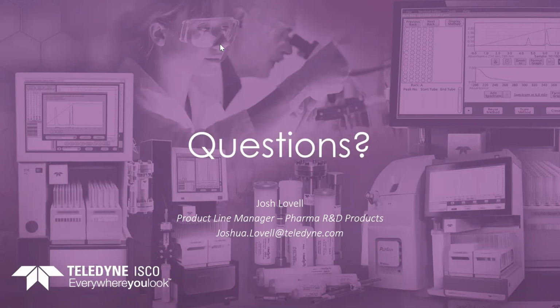And that way you'll be able to essentially see one peak retention. So that's something that acidic or basic modifiers could help clean up the resolution. If you know that it's the same compound, it could be one is charged and one is not, and you can change the solvent conditions to do that.